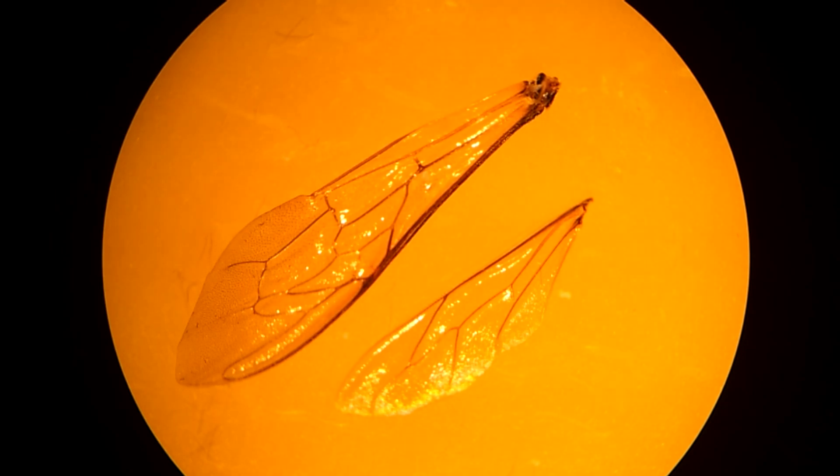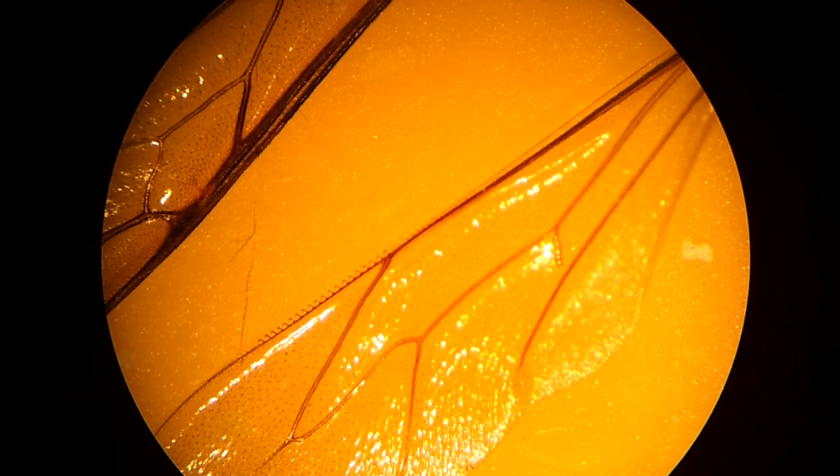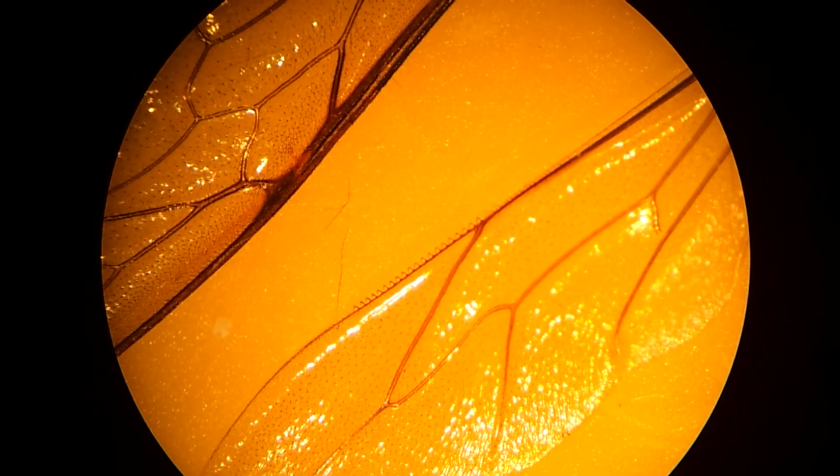Here are the wings. They have two pairs. The larger front wing is shown upside down here — I couldn't get it to stay right side up; it kept flipping over on me, so I left it as is. But the really interesting feature I wanted to show are the hooks found on the smaller back wing. These hooks allow the small wing to hook onto the larger wing during flight.